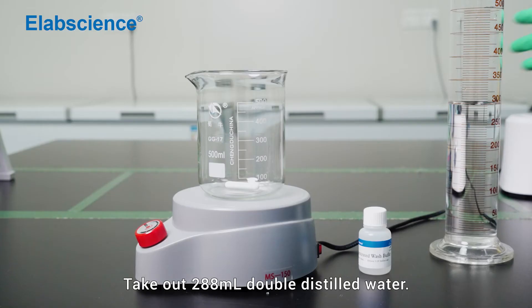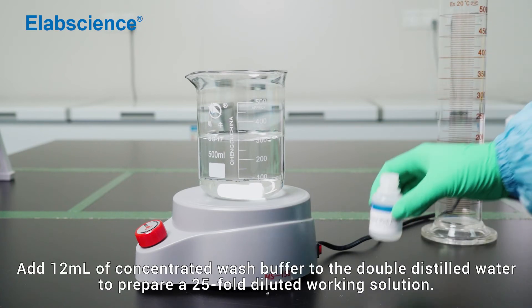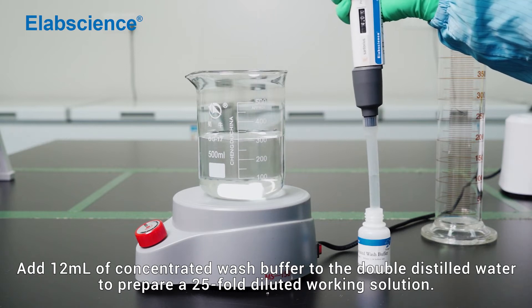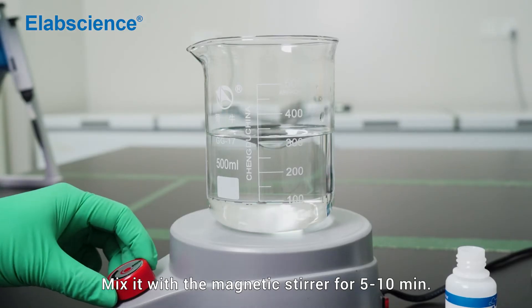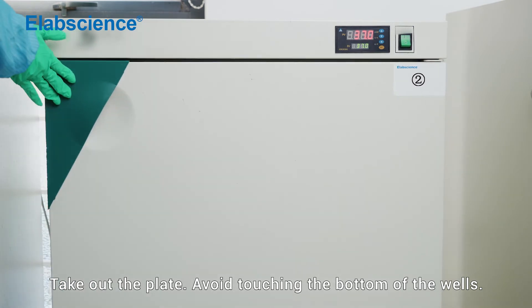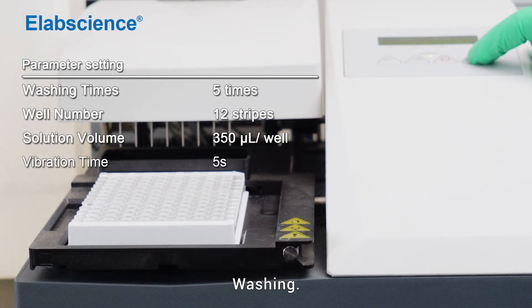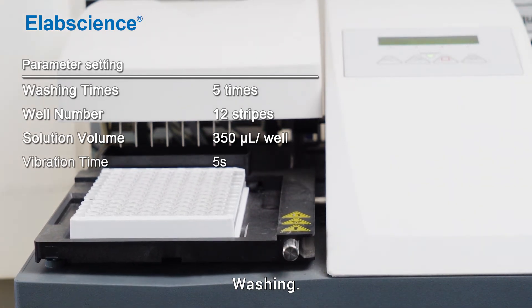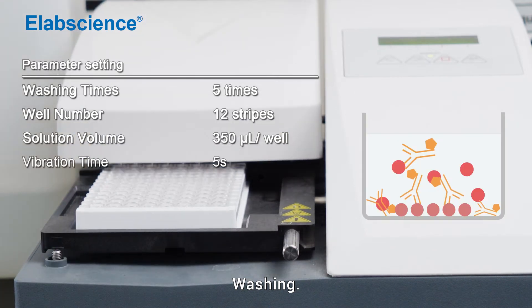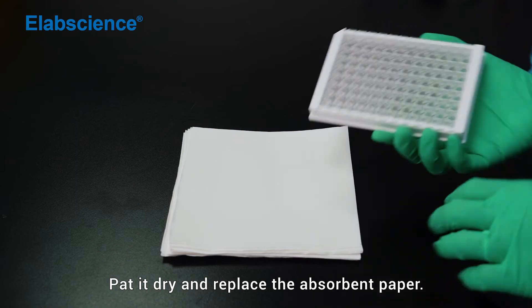Preparation of one-time washing buffer. Take 288 mL of double-distilled water. Add 12 mL of concentrated wash buffer to the double-distilled water to prepare a 25-fold diluted working solution. Mix with the magnetic stirrer for 5 to 10 minutes. Take out the plate, avoid touching the bottom of the wells, and decant the solution from each well. Wash it and pat it dry, replacing the absorbent paper.